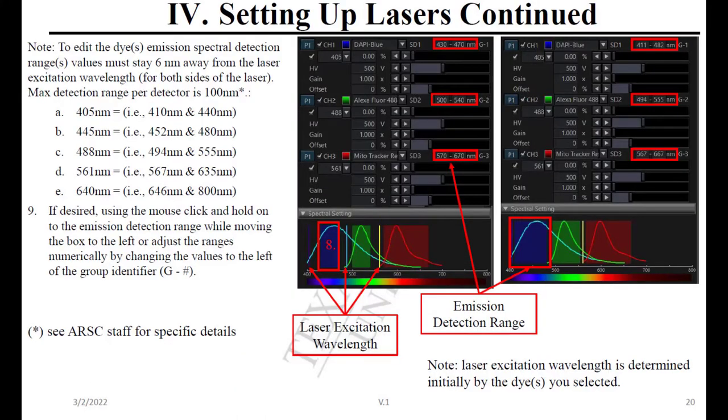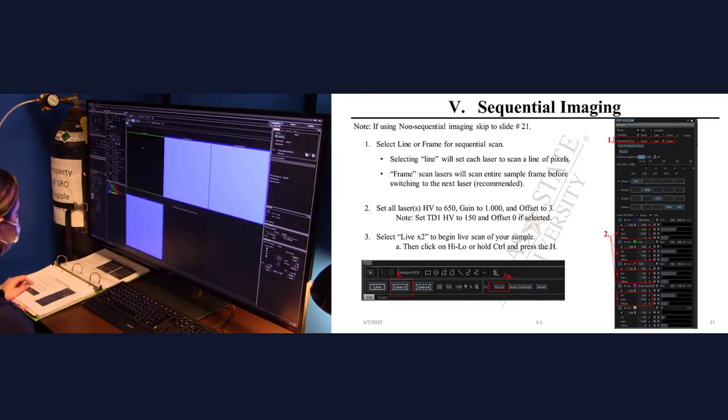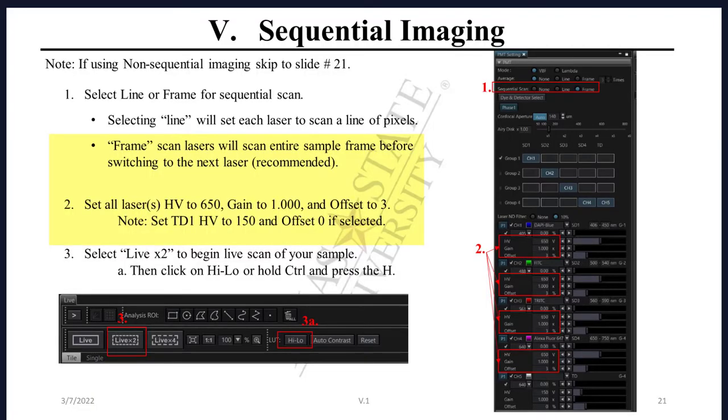Please verify that you are capturing the correct emission spectra for your sample. For sequential imaging, select frame. Set all lasers HVs to 650, gain to 1, and offset to 3. If using the transmitted detector, then set that HV to 150 and the offset to 0.